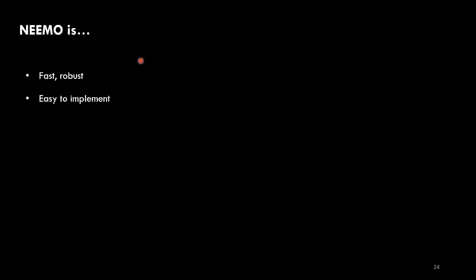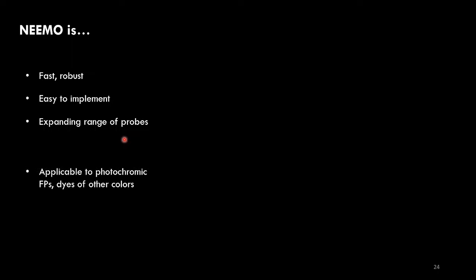And NEMO is actually expanding the range of probes that can be used for multiplex imaging, because from now on we can also use very fast switchers, and we don't need to resolve them directly by the camera. NEMO is also applicable to photochromic fluorescent proteins and dyes of other colors. I showed you an application for green fluorescent proteins, but of course, if you have light-induced dynamics when using red fluorescent proteins or any other color, it's also possible. It just needs to be adjusted in terms of wavelengths.